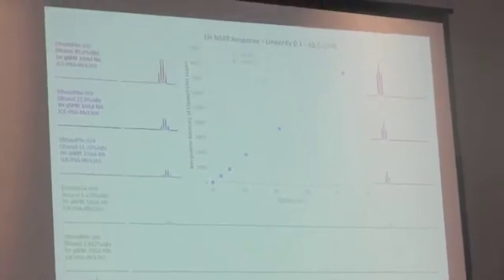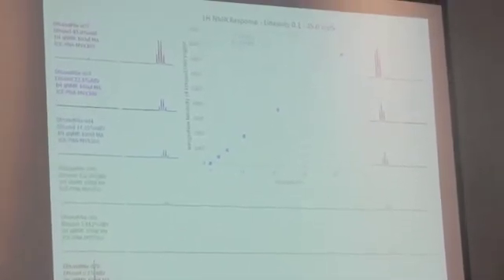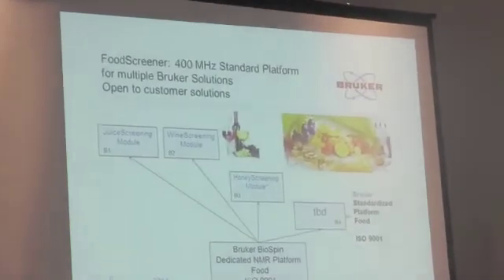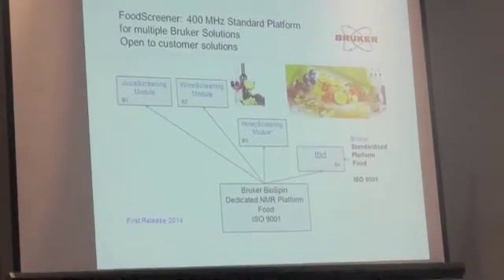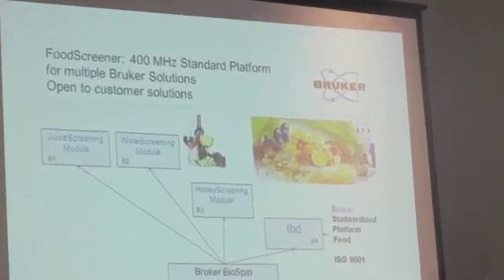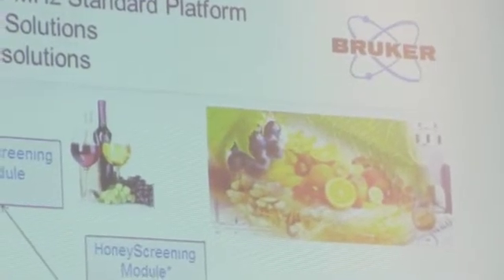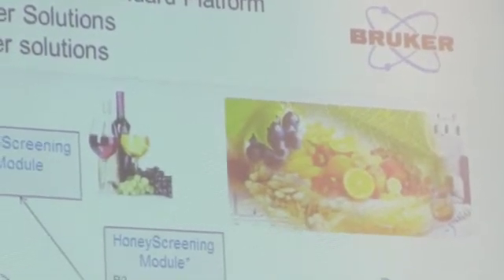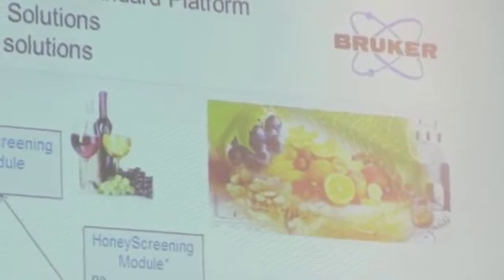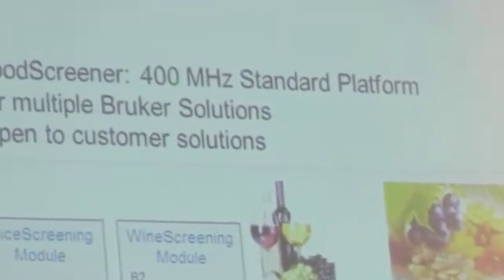So you can see stuff down in like the hundredths of a percent range all the way up to like 45% in Applejack or something like that. And one of the reasons I started thinking about beverages is there are two companies that make the equipment, and these guys are in Germany. They've been working for years with all the Appellation Controlée in France, some of the bodies in Germany, and in Czech and in Hungary to build databases of the wines.